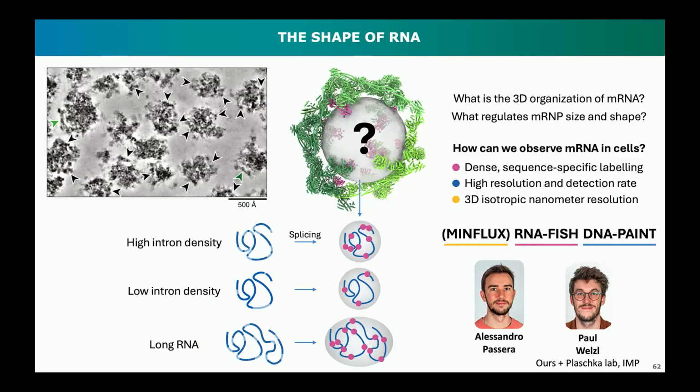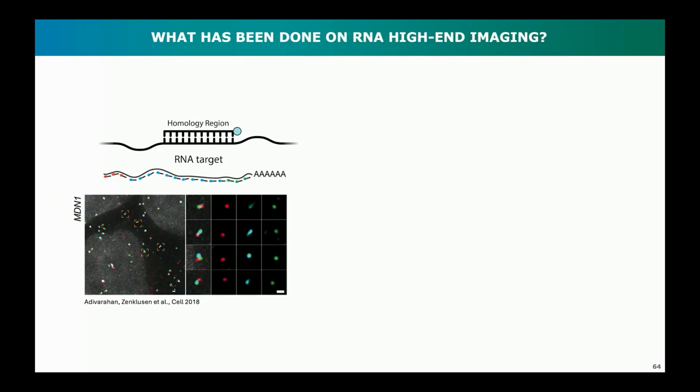So these two PhD students of my group, one of them shared with another group, embarked on this very ambitious task. And the first goal that we had with this was to try to correlate morphology of RNA particles with their gene architecture. So what happens if a gene is longer or it has more introns, because introns that are spliced out of mature transcripts receive a marking in the shape of a complex called the exon-junction complex. And these complexes are known to interact with RNA and with other proteins. So they may bring stuff together, or something might happen.